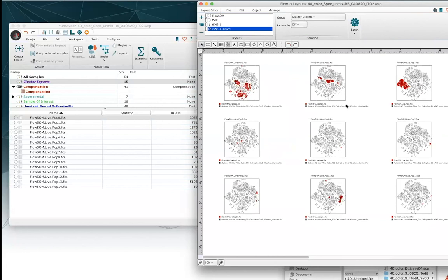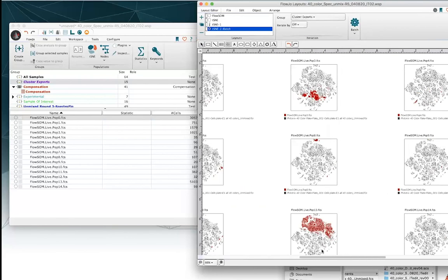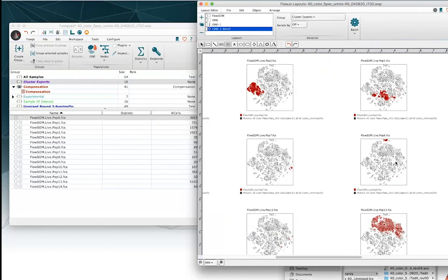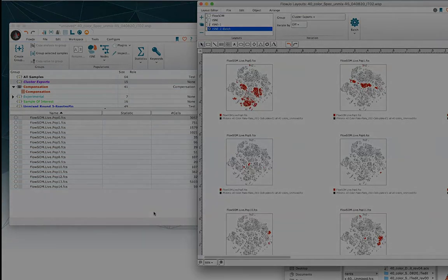Now I can really clearly see where every single one of my FlowSOM populations is sitting relative to the global t-SNE we've been looking at previously. Some populations are quite numerous, like population 13; some are quite small, like population 8. And if you remember, population 8 and 13 were earlier difficult to distinguish simply because their color shading was pretty much the same. This is also a handy trick when multiple populations are sitting right on top of each other. Thank you so much for joining me for this brief tutorial — I'll catch you in the next one. Bye for now.